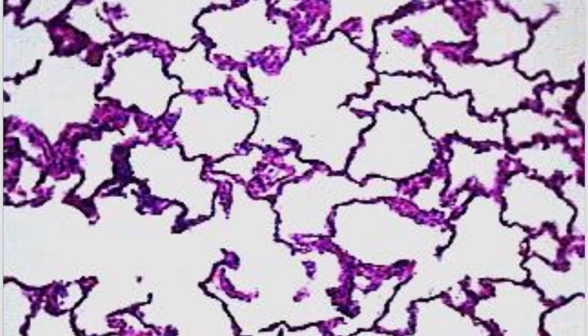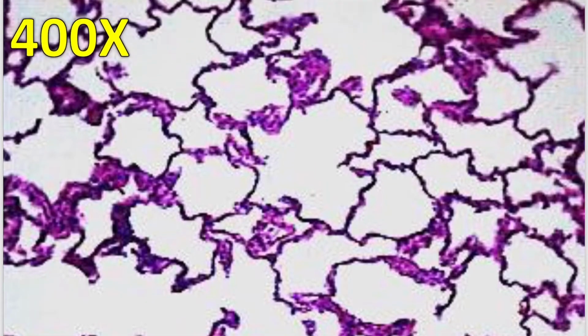So what I'm going to do is label things on this slide so you can get an idea of what we're looking at here. And then just keep in mind that what you're seeing here is just zoomed out. The other thing I want to point out is you're going to see a lot of pixelation. You can see here that it's rather pixelated. That's because the microscope camera that we have available at school to take these pictures when the slide is actually in the microscope is really, really old. And I think we're talking like not even 2 megapixels. So you are going to see quite a bit of noise in these pictures.